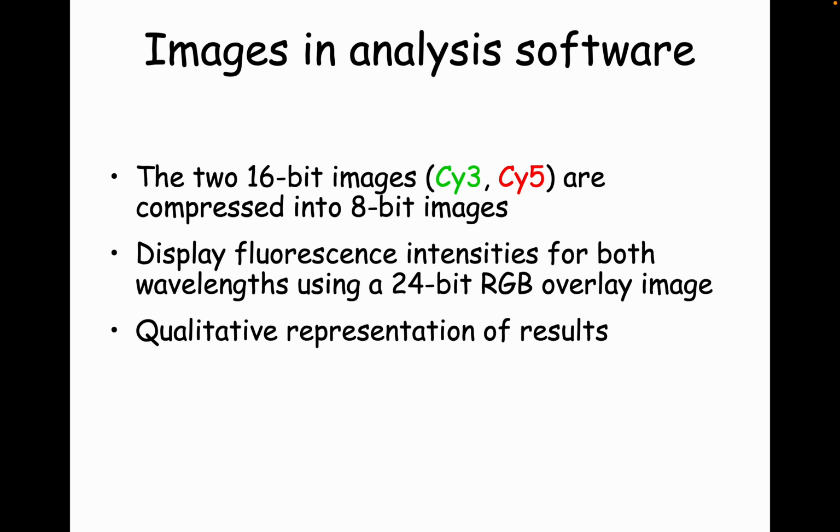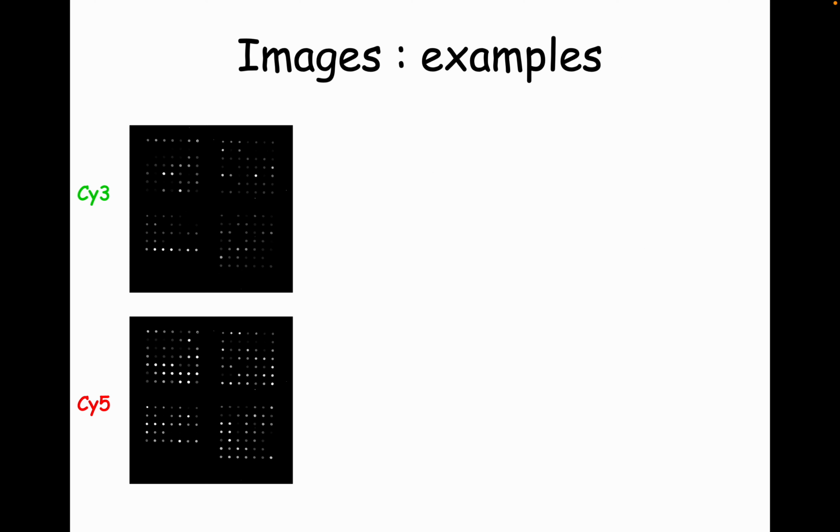Represent the results. What people would normally do to be sort of friendly to people who see things differently is you would normally convert the green to blue, which you can do with an image analysis tool. If it's this bright green, you turn it into the same brightness of blue, and it's the same digitally, because you're just representing a thing. Same thing with red, you might turn that into yellow, and blue and yellow will come together, and those would make white when they do come together.